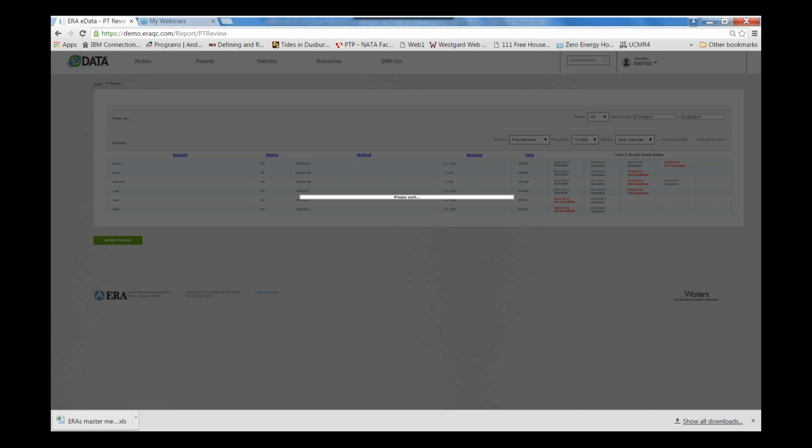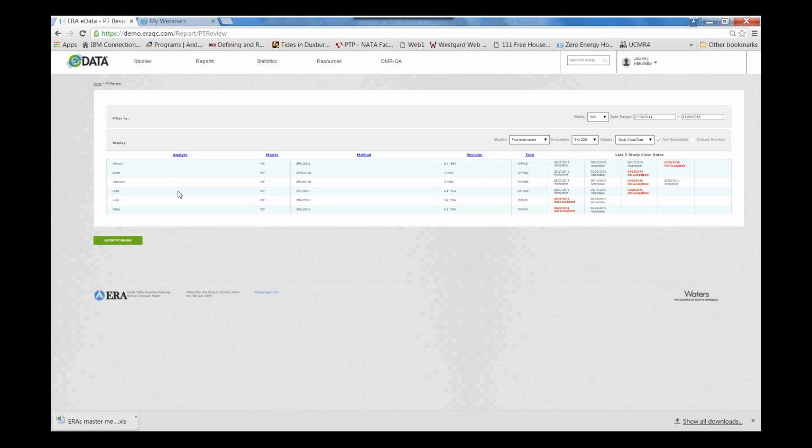So I'm going to go back just to my not acceptable results here. I see my lead. I've got 2 methods, EPA 200.7 and EPA 200.8. My last round here, I did have that not acceptable on 246, but it looks like I'm okay because the last time by this method here on WP 240, my results were acceptable. So no accreditation risk on this one. We're safe for this time, but certainly we've got some work to do to investigate that analyte.